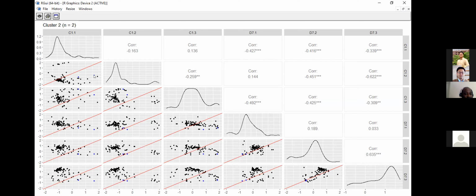So these are the blues. You can see they're just two. In this case it's hard to tell, but I think that's why bioinformatics is very important, and I'll make it easier for you to analyze all this. So that's that for that.